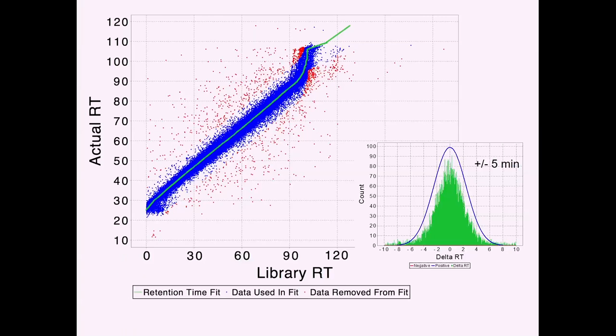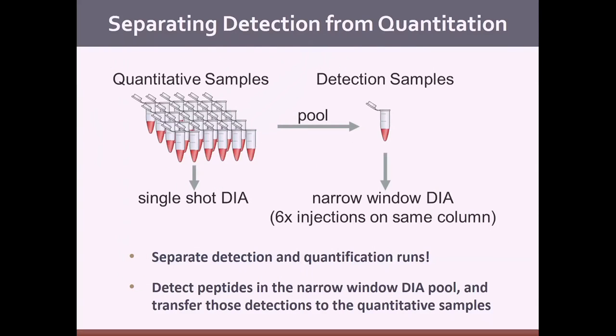And so this was still pretty powerful, but he felt like this is something that could be improved upon and might be valuable. So one thing that he has been advocating in our lab for a while now, and other people as well, so Sonia started thinking about this too, and that is, can we separate out the step of detection and quantification?